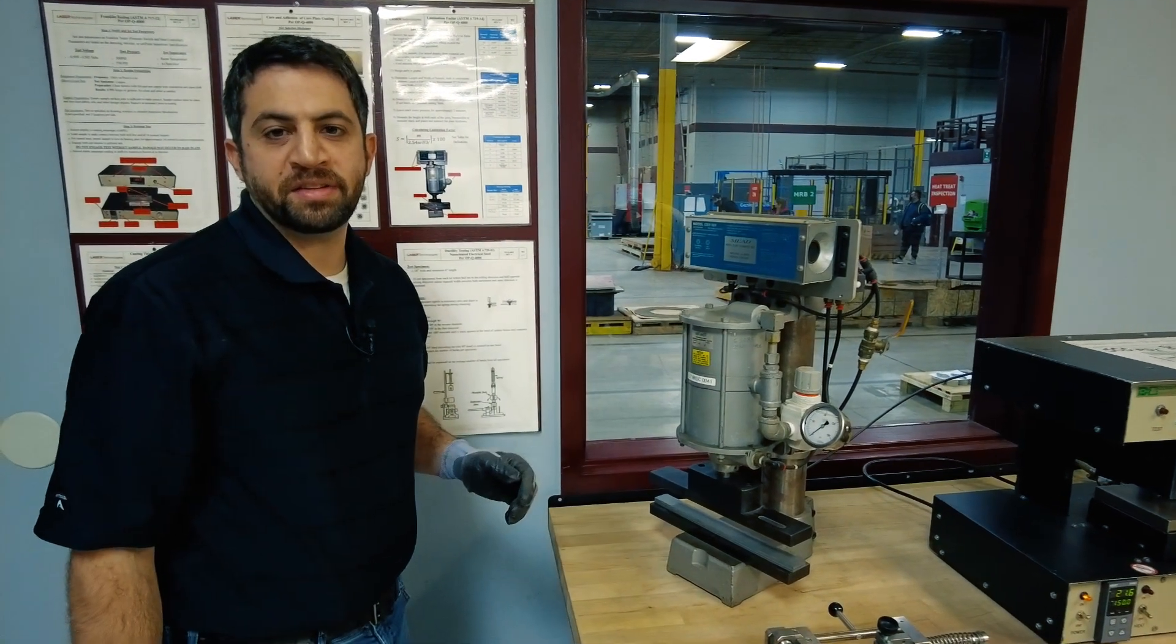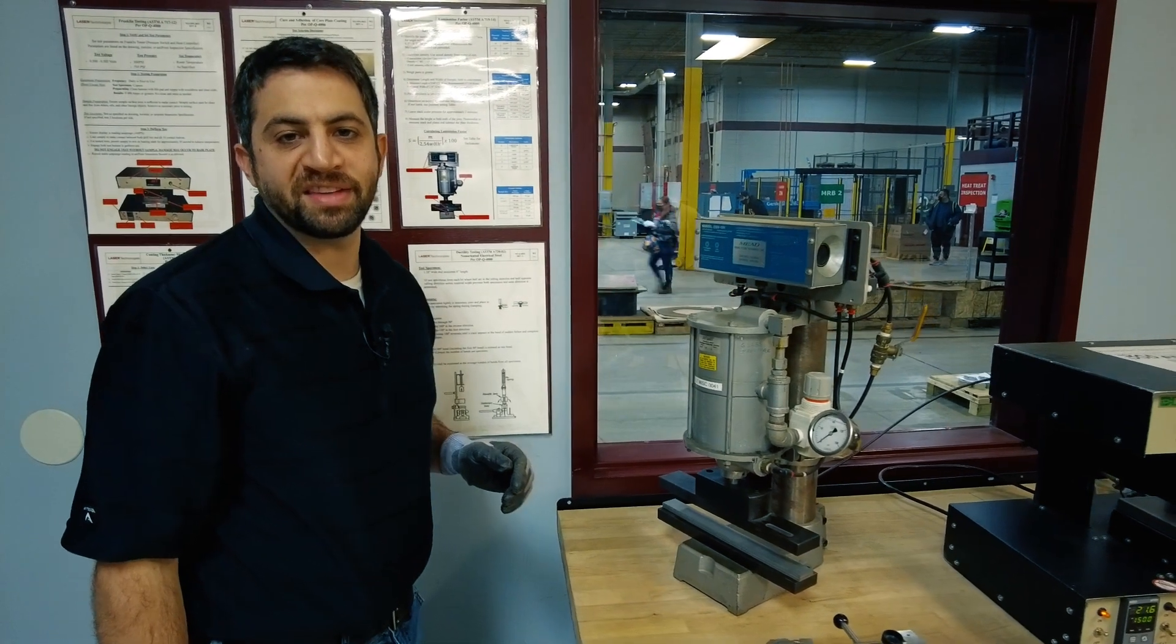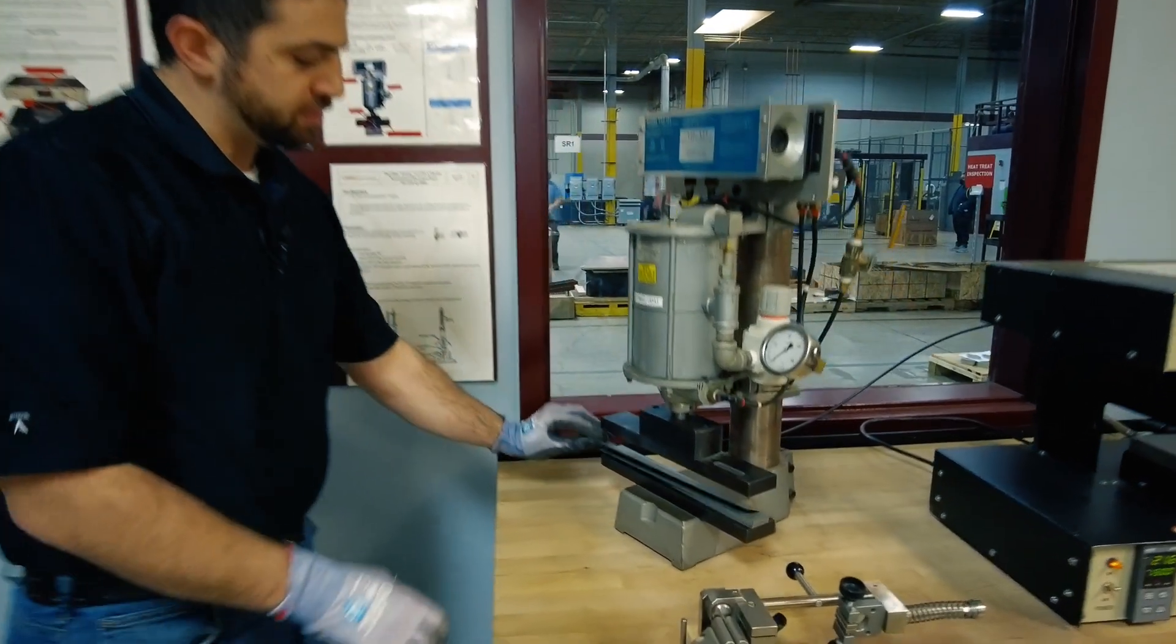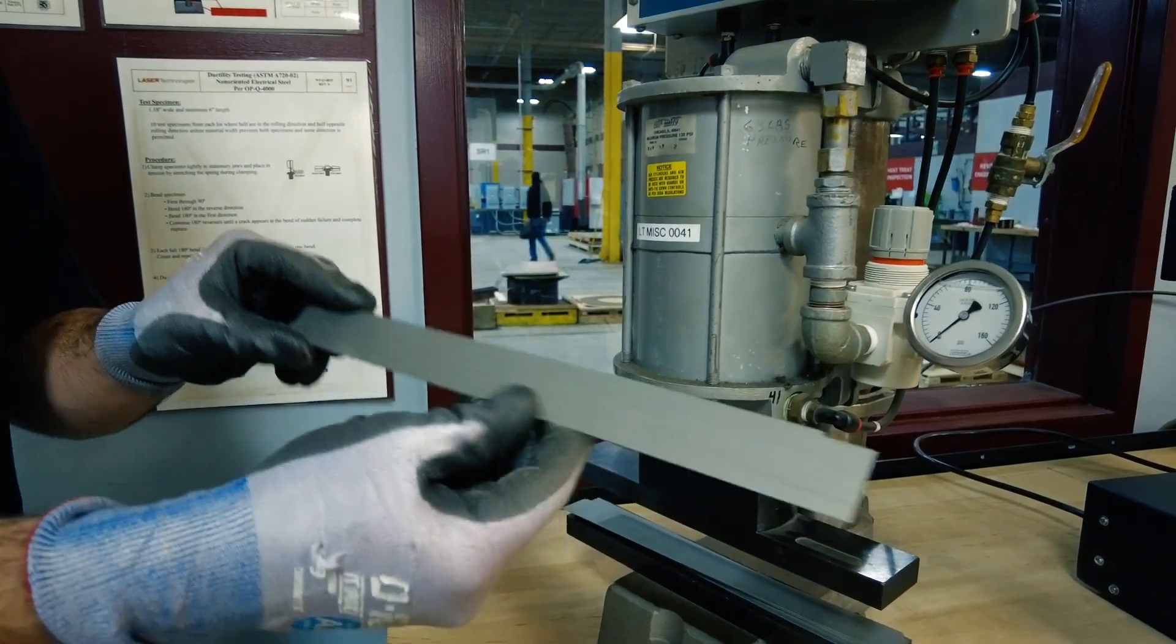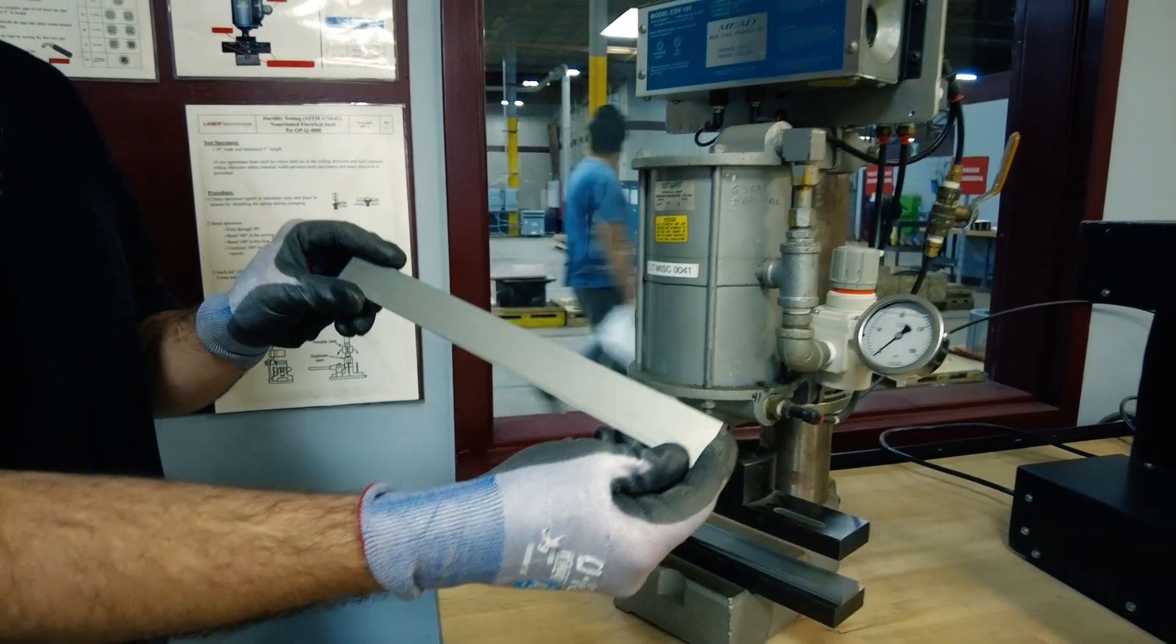This is a stacking factor test governed by ASTM A719. We'll take strips of material that are coated with core plate coating and get measurements on them in terms of size and weight.